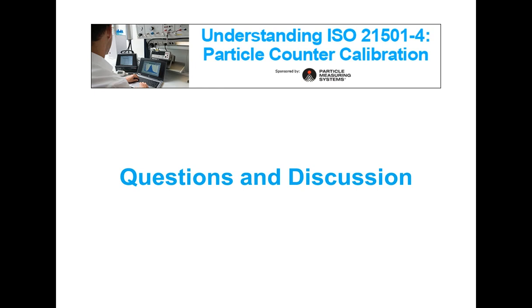We have a question: does ISO 21501-4 apply to compressed air and air particulates in clean rooms? ISO 21501-4 doesn't specifically talk about compressed air testing. However, the instrument that you are going to use to test your compressed air must be calibrated according to 21501.